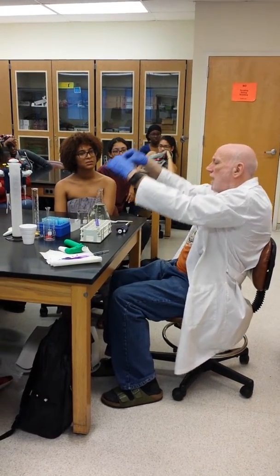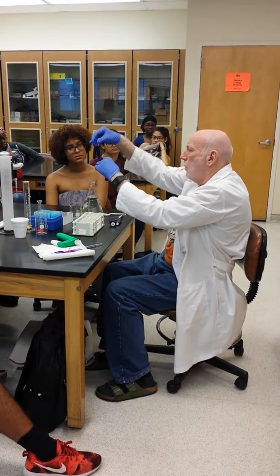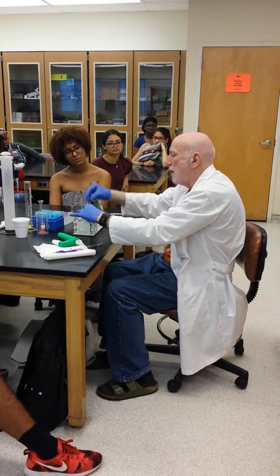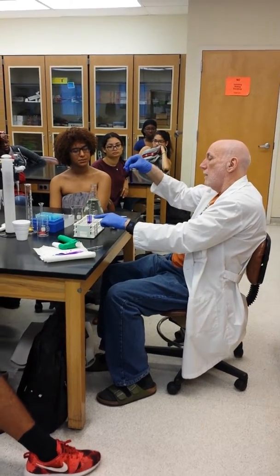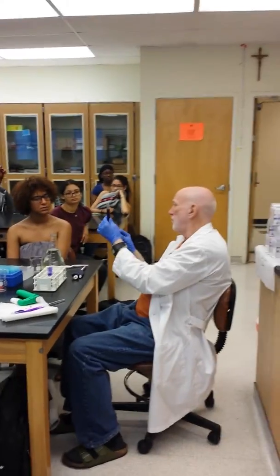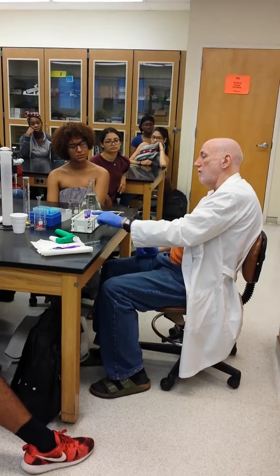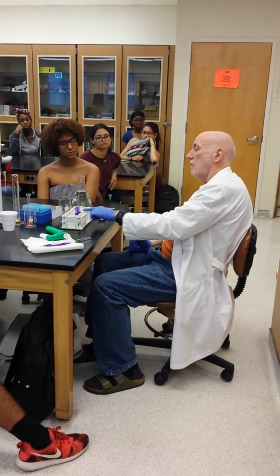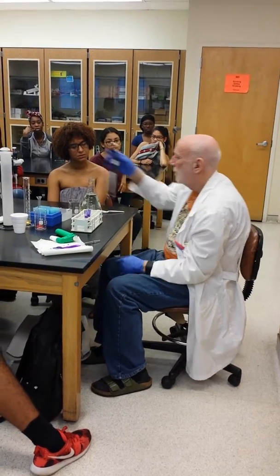See any differences yet? 1 molar, 1/10 molar. What's the molarity here now? Hey, I took 1 ml of here and put it into 9 mLs here. Counting down by tens. So a 1 molar solution, a 10th molar solution, a 100th molar solution. So far, so good.